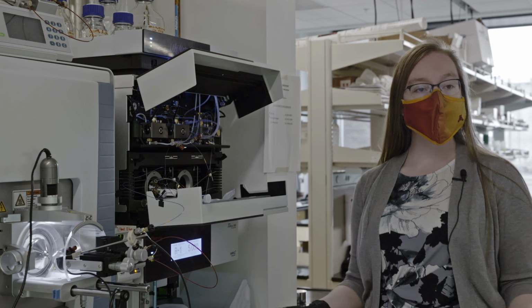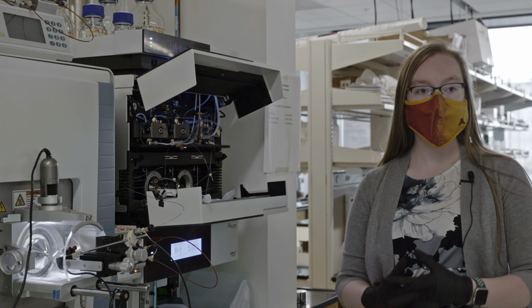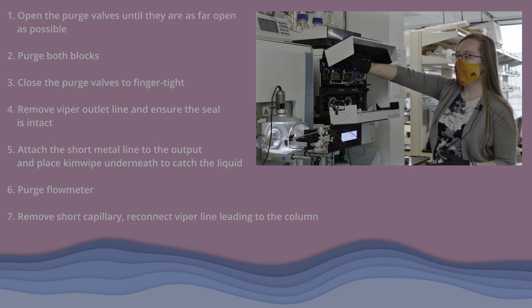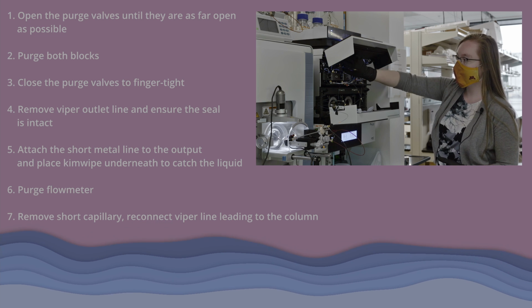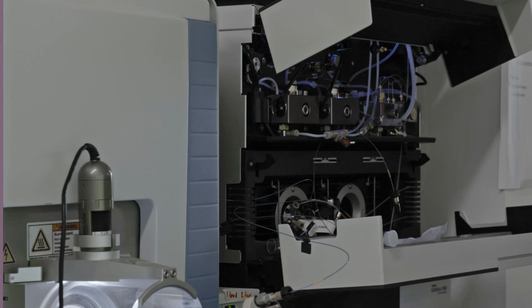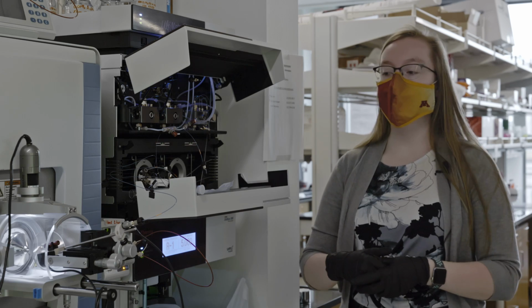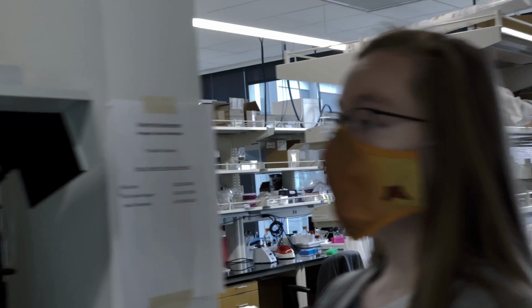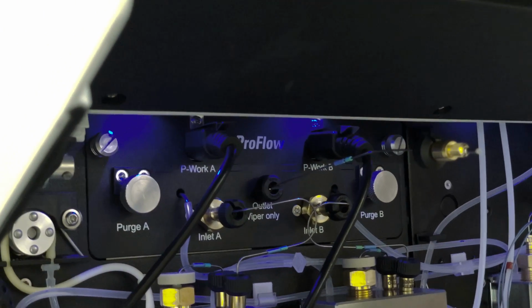So once you have finished purging the instrument, the next step will be to attach your column. To do this, you'll remove the stainless steel line that we put in place for the flow meter purge. So once the flow meter purge has been concluded, you'll want to return to the instrument and reattach the lines. So to start, we will remove the stainless steel line that we added in for the purge.